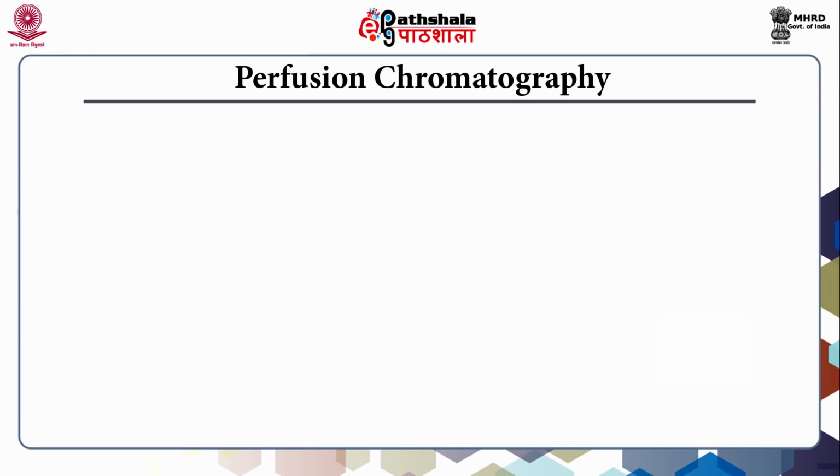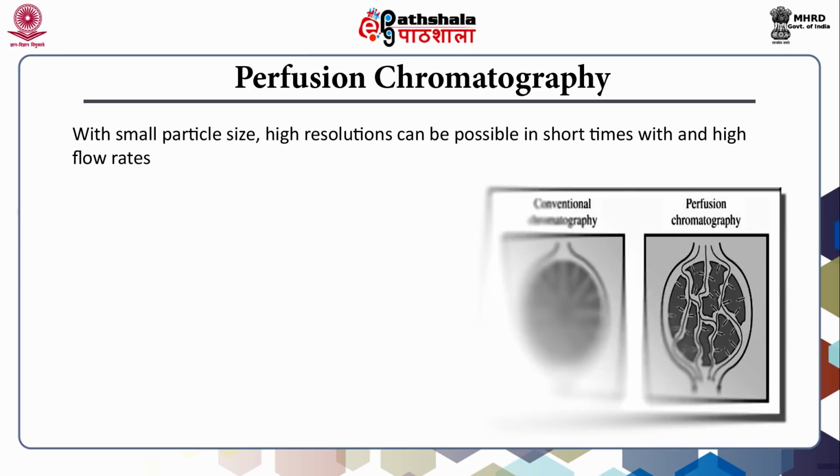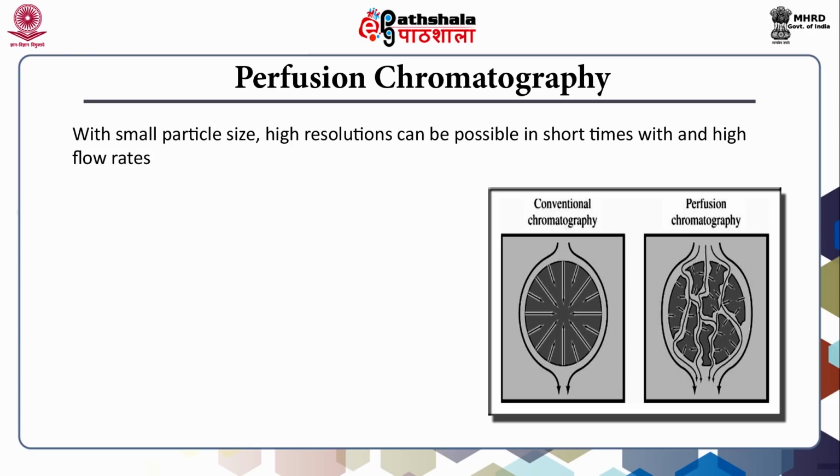So, perfusion chromatography means with small particle size, high resolutions can be possible in short times with high flow rates. This happens in case of perfusion chromatography. In this chromatography, the stationary phase particles contain not only longitudinal pores throughout the particle, but also diffusive pores that are connecting the longitudinal pores. This can be seen in this picture in this particular slide.